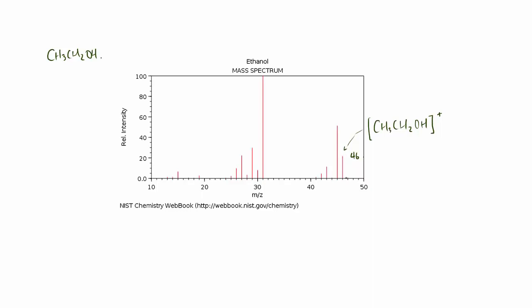There is one final one here which is quite an interesting one, and this is called the M peak. This would be the M+1 peak, and that's due to the presence of carbon 13. It forms about 1% of all carbon, but we can see here that the presence of that carbon 13 gives us that tiny little extra one. So this is actually at 47 there, and that's giving us just that little bit more.